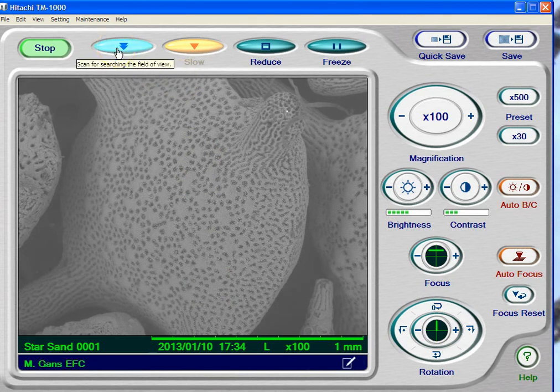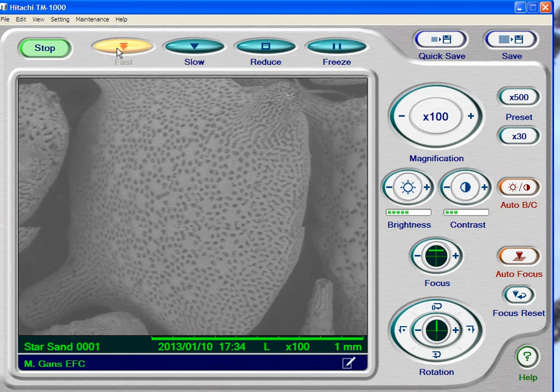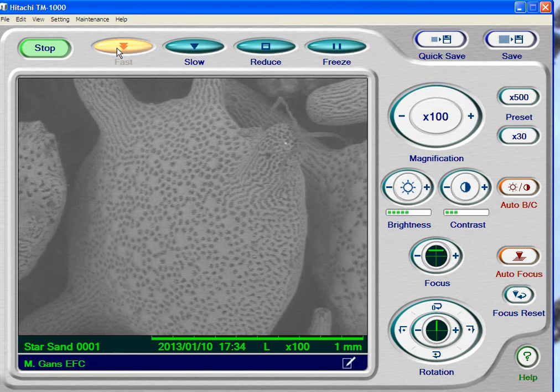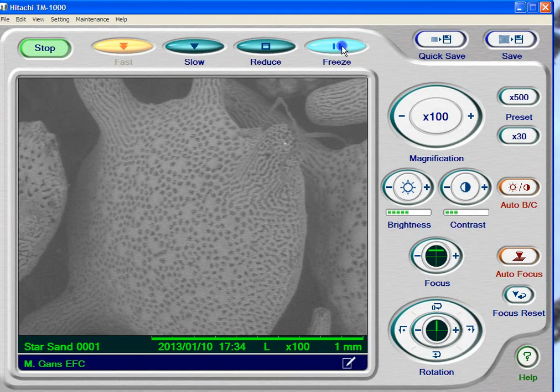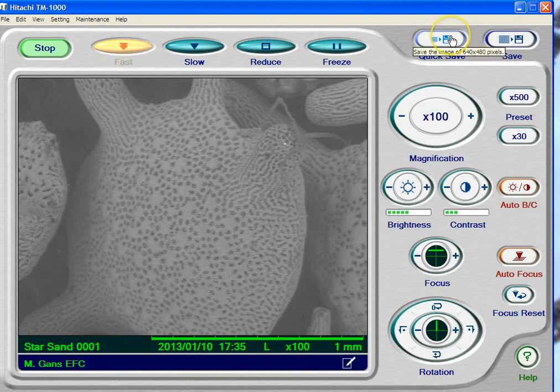Normally what we're going to do is go on fast scan just to look around, because that way when I move things it refreshes much faster and you don't get a really distorted look. Reduced is exactly what it says — it reduces the field of view and scans much faster; you can use that for focusing. We'll turn that back off and go back to fast. You can also freeze the picture, which I don't use. Quick save I also don't do. Save is exactly what it says — you're sending your image to a file on the computer, actually on the S drive.